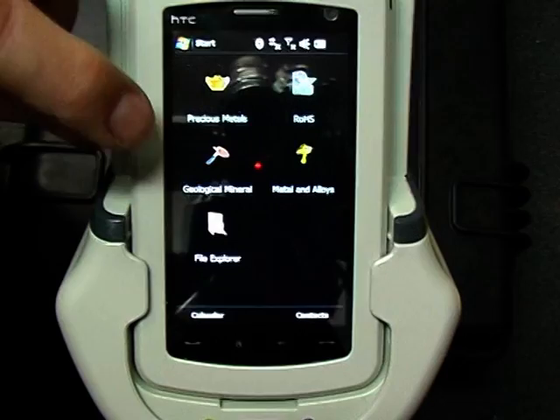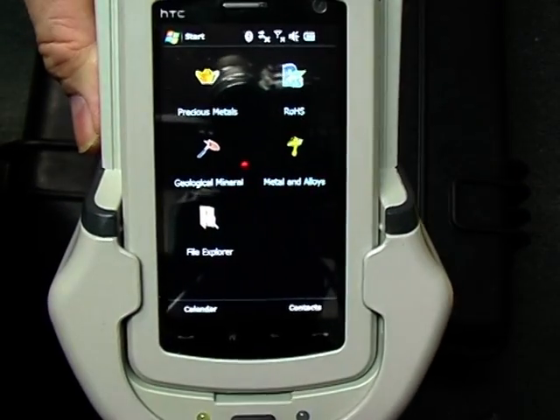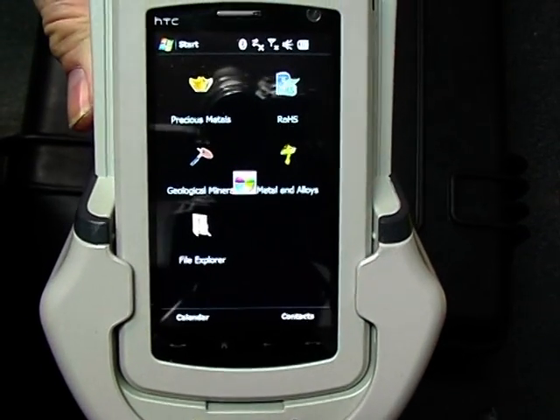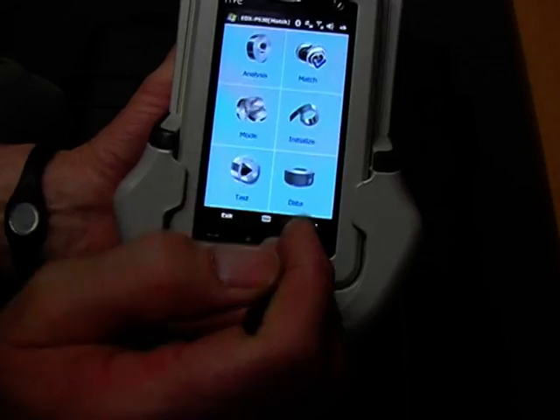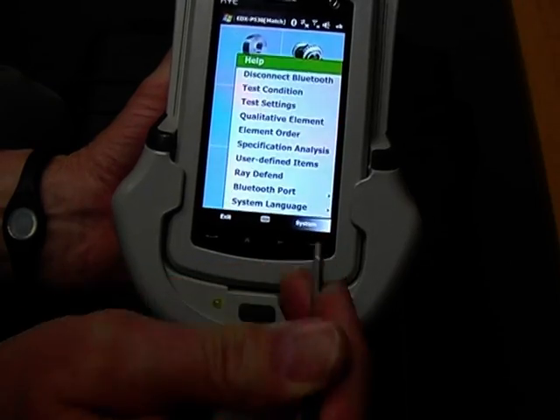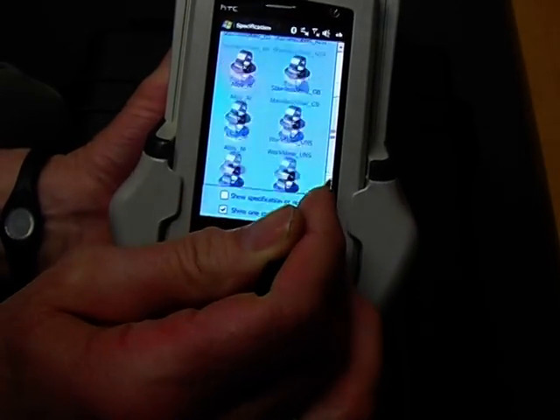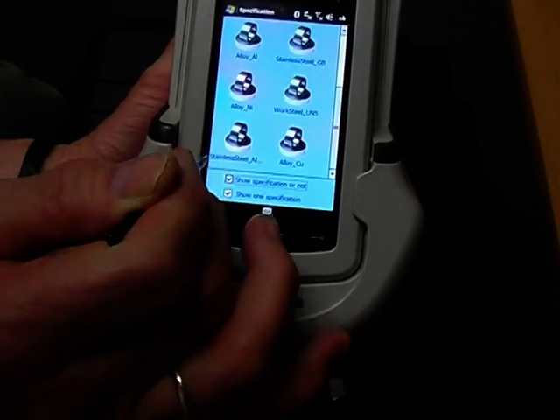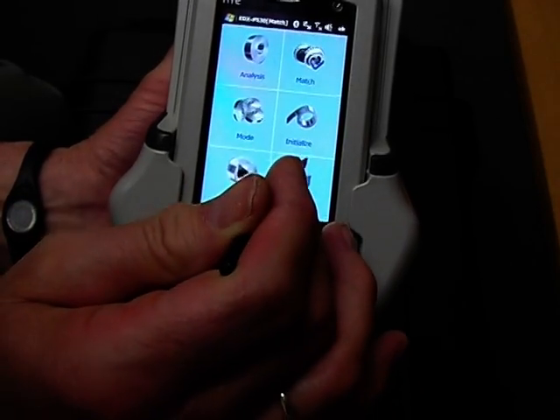We select the metals and alloys program — loading takes around 30 seconds. First, we're going to do a match, so I need to select the system here. Under specification analysis, scroll down, check this box here — both checked — and the stainless option there.